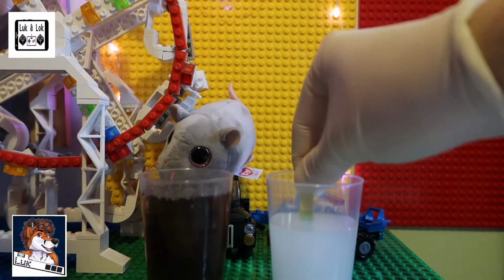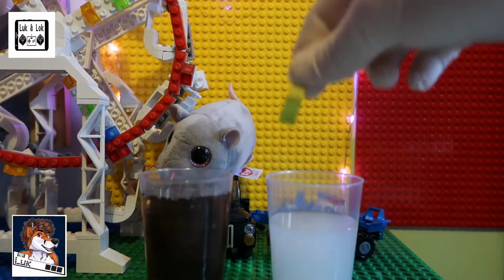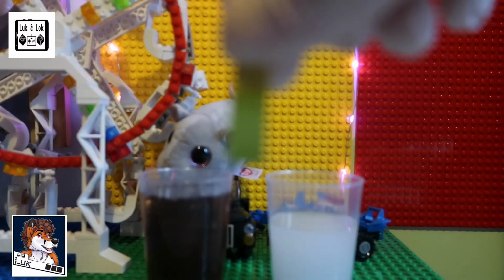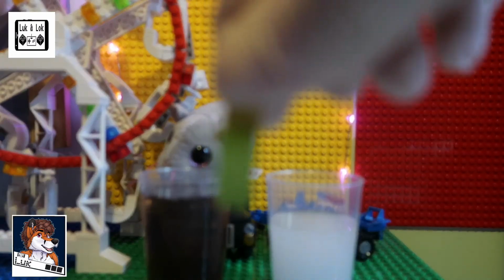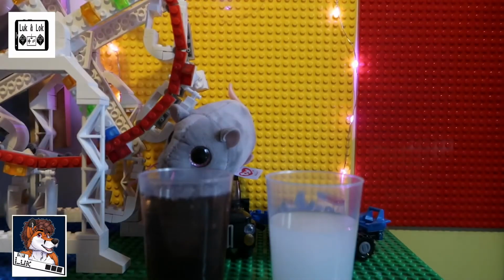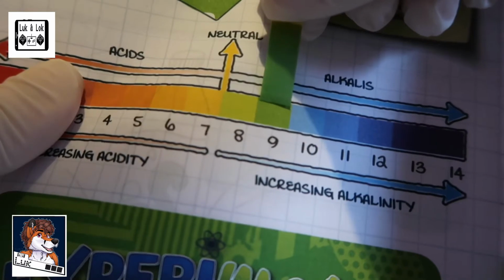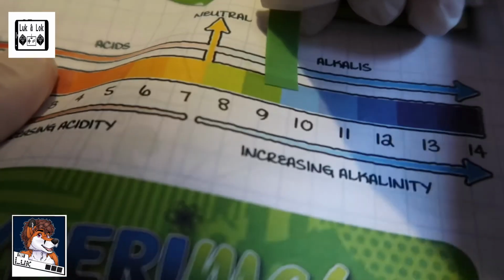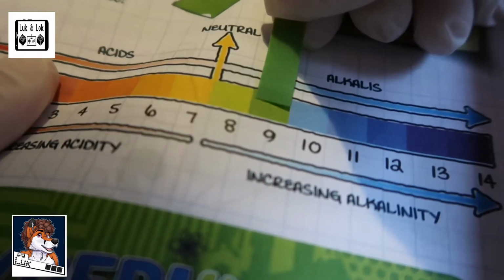Next up, I've got vinegar all over the other pH strips. That's lovely. Now this one in here has gone a funny shade of green. It's more of a greeny blue, so it's sort of like pH 9. So it's more of an alkali. It's gone sort of a greeny blue. So yay for alkalis.